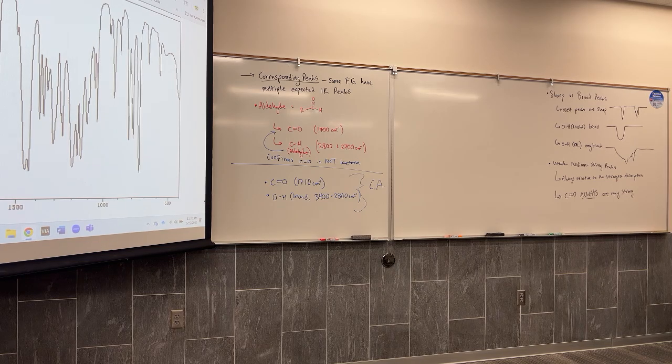Question with broad versus sharp: is it how quickly it returns up to baseline or how sharp the bottom of the peak is? That's a great question. Or some combination thereof? Generally, it's how sharp the bottom of the peak is. Like if you were doing math, like the slope of the sides too. So if you potentially have a sharp bottom that overlaps with it.